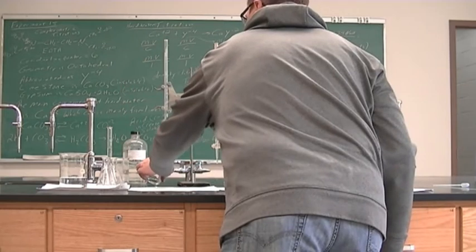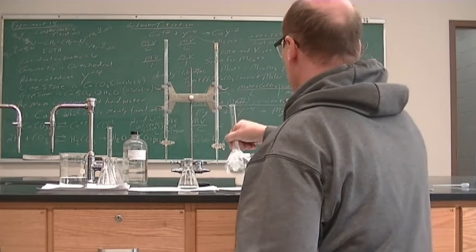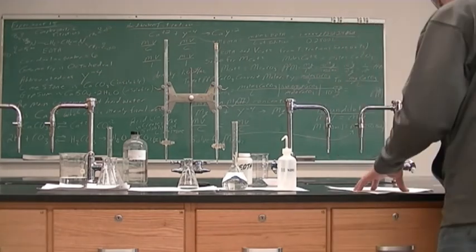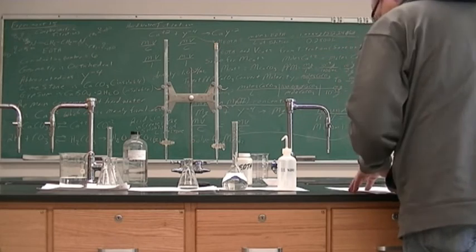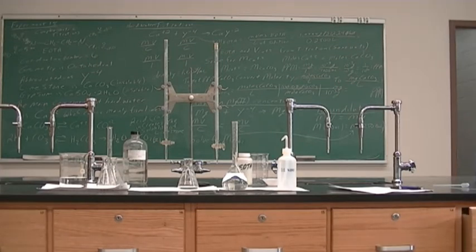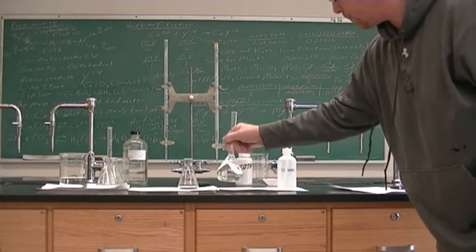All right, so now to get this ready for the titration, we have to add a lot of different stuff. It says 25 mils. We have our 22.5 mils. We will calculate it exactly. We're going to add some ascorbic acid. Still some solid EDTA in there.